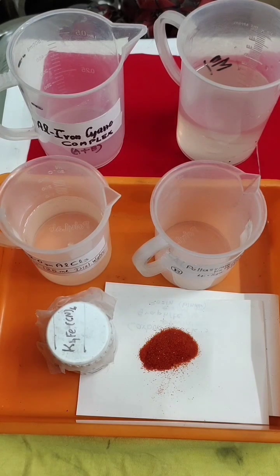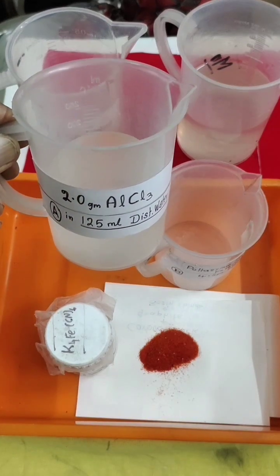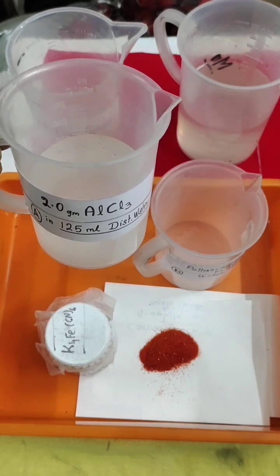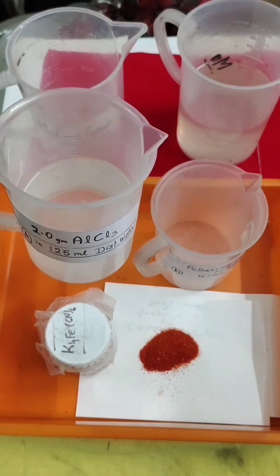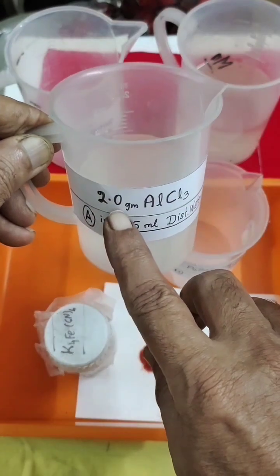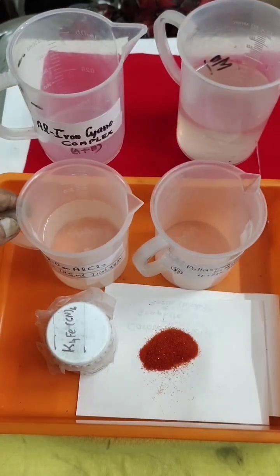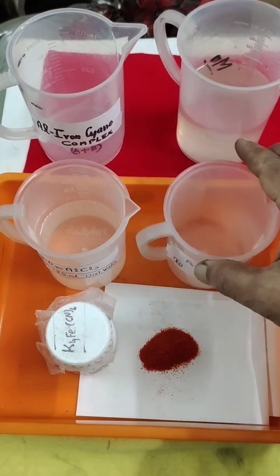I made aluminum chloride by dissolving aluminum pieces in concentrated hydrochloric acid. I'll put the details in my diagram — how much I added and how I prepared the aluminum chloride solution. That was nearly 23.5% aluminum chloride. I was able to dissolve 2 grams of aluminum chloride in 125 ml of distilled water. This is my aluminum chloride solution.